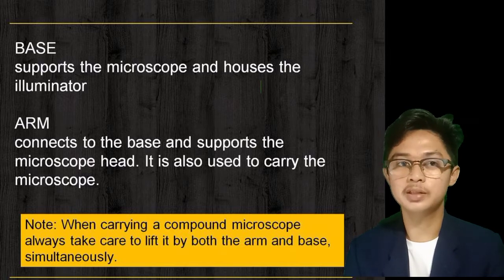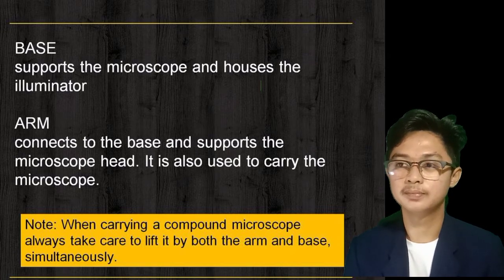You should take note that when carrying a compound microscope, always take care to lift it by both the arm and base simultaneously.